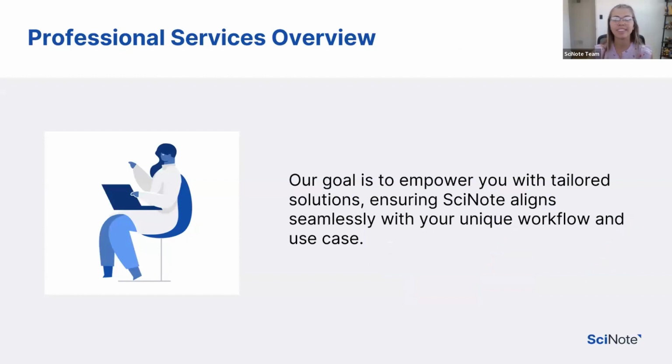There we go. So, professional service overview. We've listened to your feedback and we're thrilled to share that this year we are placing more emphasis on professional services. Our primary goal is to allow your team to customize SciNote to perfectly suit your requirements, ensuring seamless integrations into your day-to-day operations.